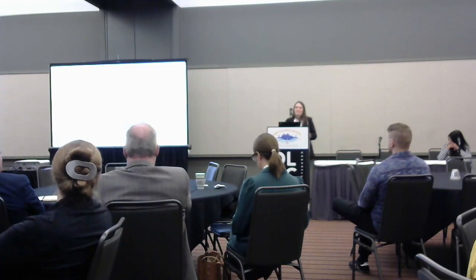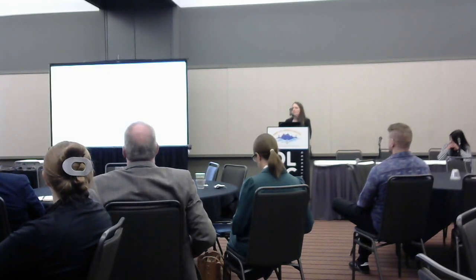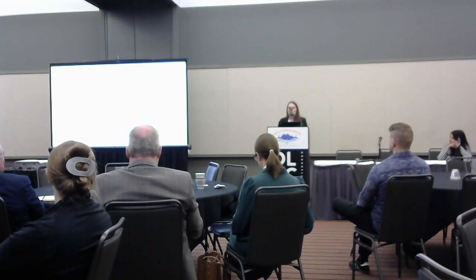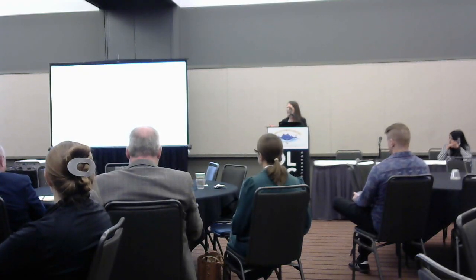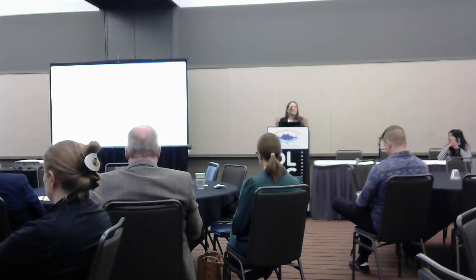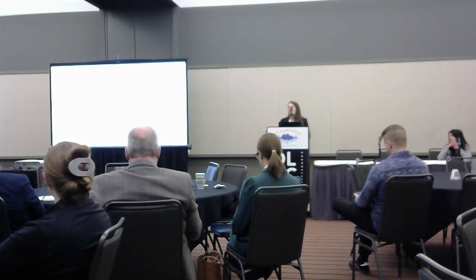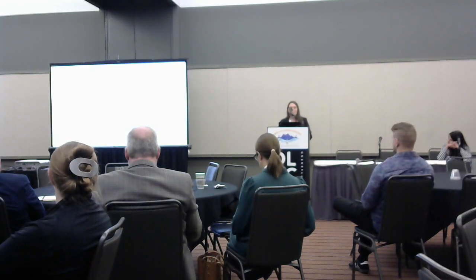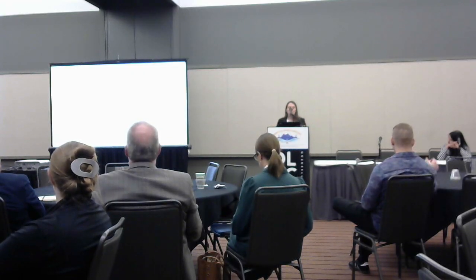Okay, so moving into the next section, and kind of the last part that I haven't talked about so far is software. Software can kind of guide your whole image analysis experience, especially when you're working with a client and you're not choosing the software yourself. So making those smart choices to help your users pick the right software is important. So this is kind of a little guide or easy way to start thinking about choosing the right software.